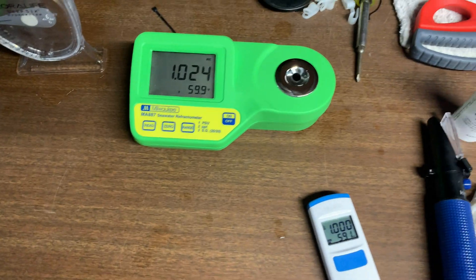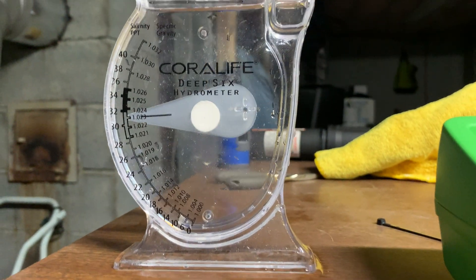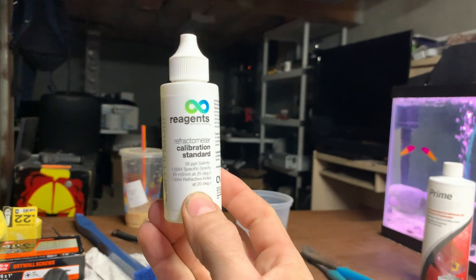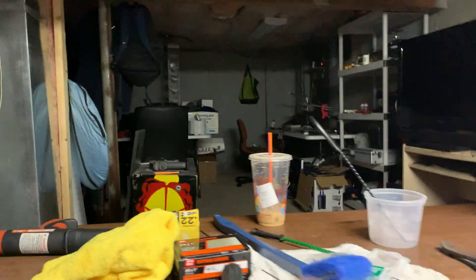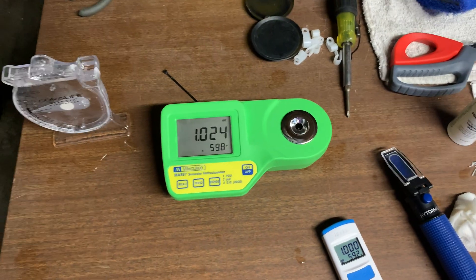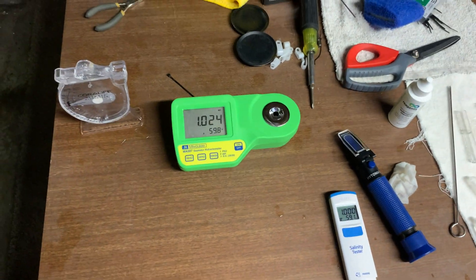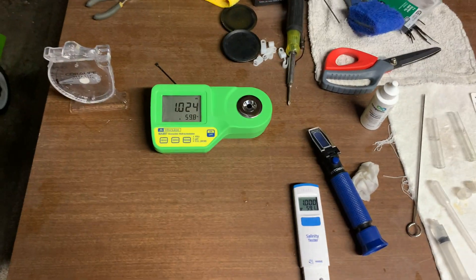This is very consistent. This one always reads the same when I reread stuff. And this one is at 1.023 as you see. Those are known for being pretty inaccurate, but I use my refractor, which is freshly calibrated with this solution — it's the refractor meter calibration — and it's calibrated perfect. That one is calibrated freshly just now. You use distilled water, or you can use deionized water. I would suggest using distilled water for a more consistent reading. Deionized water can fluctuate. Always use the same brand of distilled water so you get the same result. If you switch brands of distilled water, you might get different results.